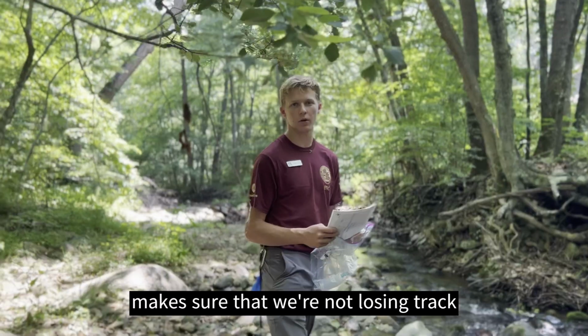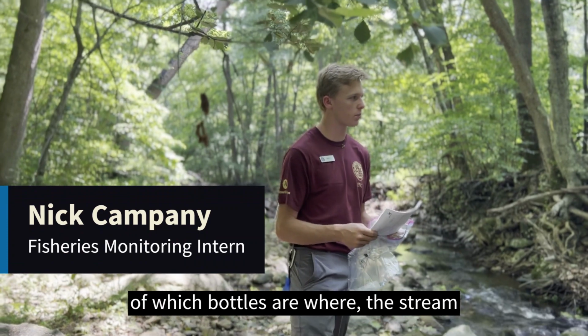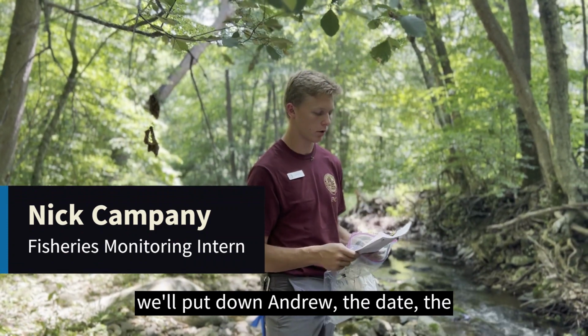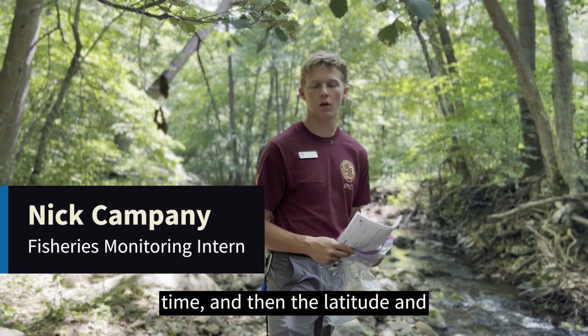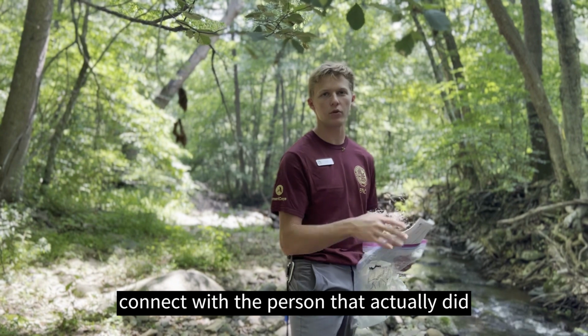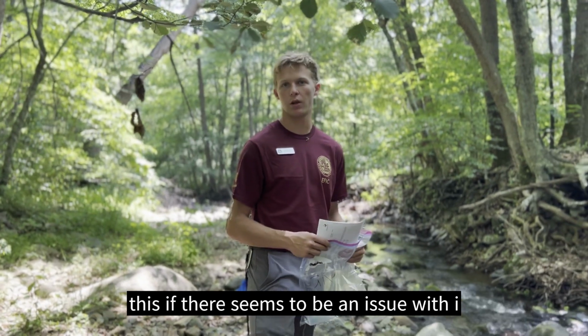So the data sheet, make sure that we're not losing track of which bottles are where. The stream name and then the collector name, so we'll put down Andrew. The date, the time, and then the latitude and longitude. So basically just to double check that everything was done, and we can connect with the person that actually did this if there seems to be an issue with it.